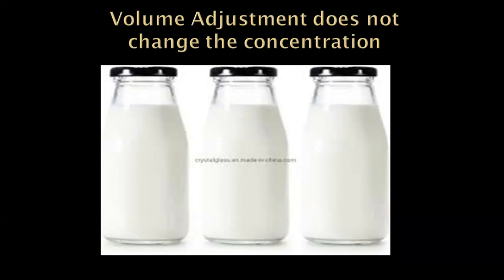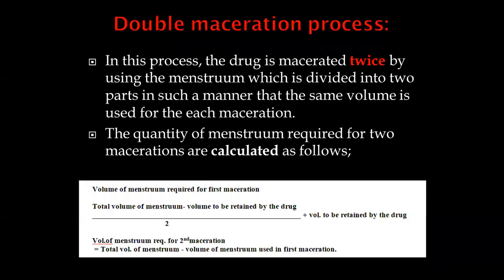So now the preparation, I wanted to make it into a concentrated preparation, either by the simple maceration process for organized drug or unorganized drug. The preparation is not much concentrated.